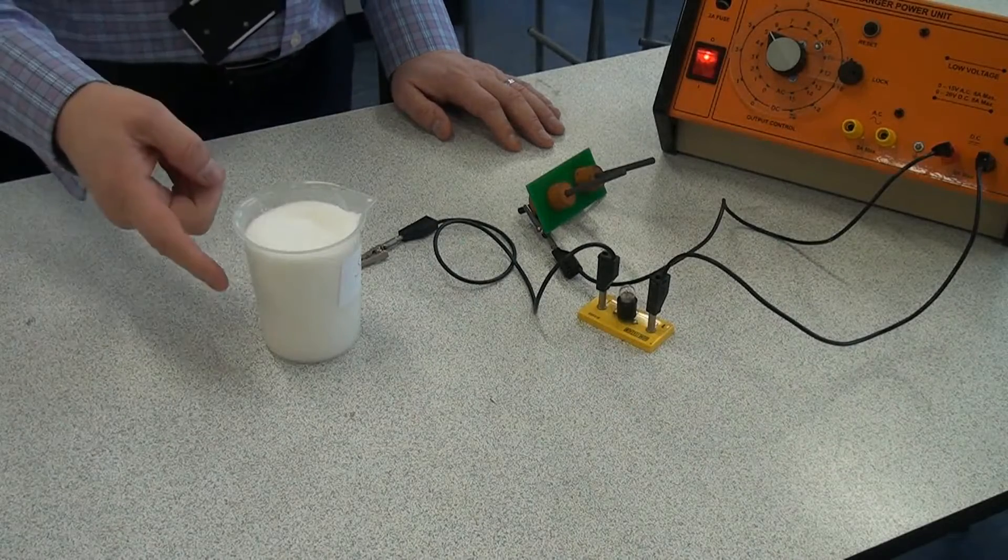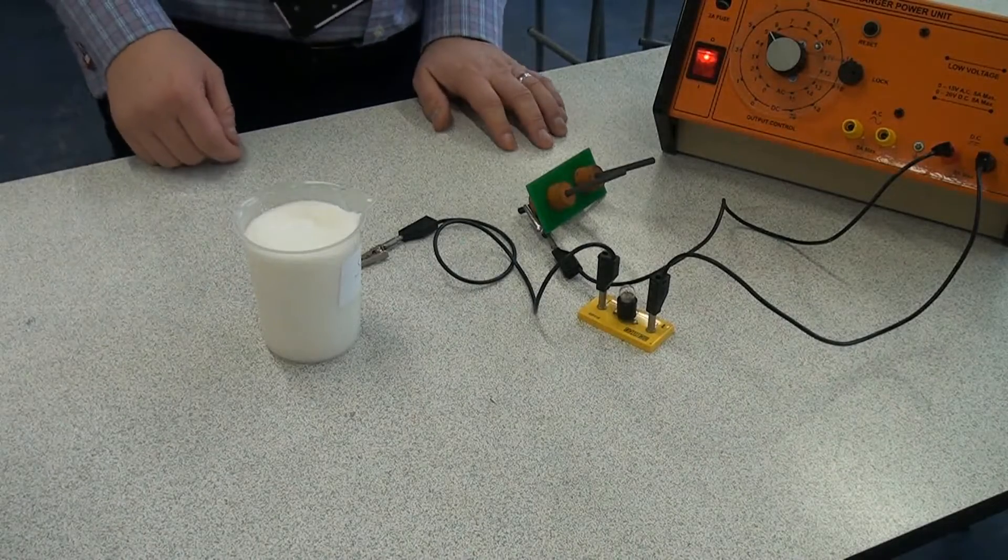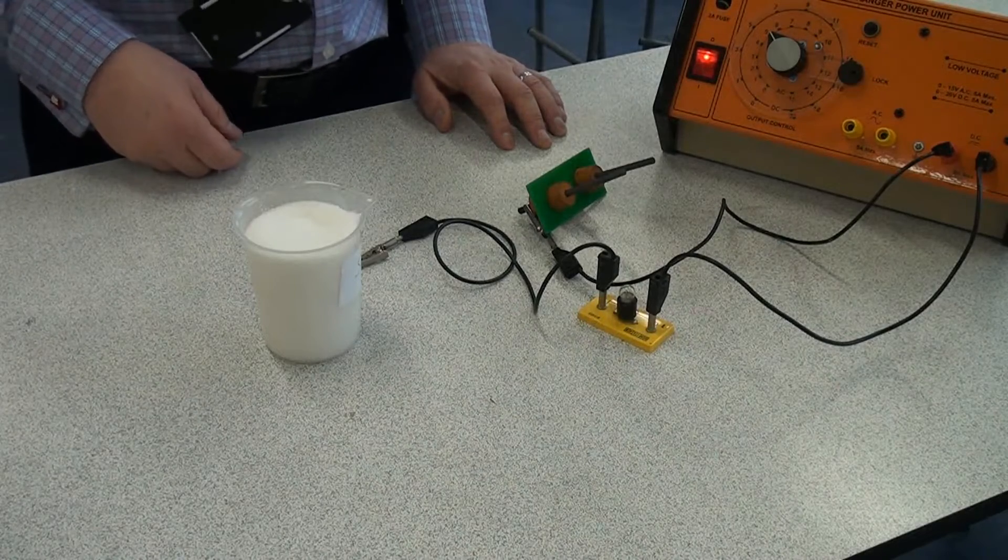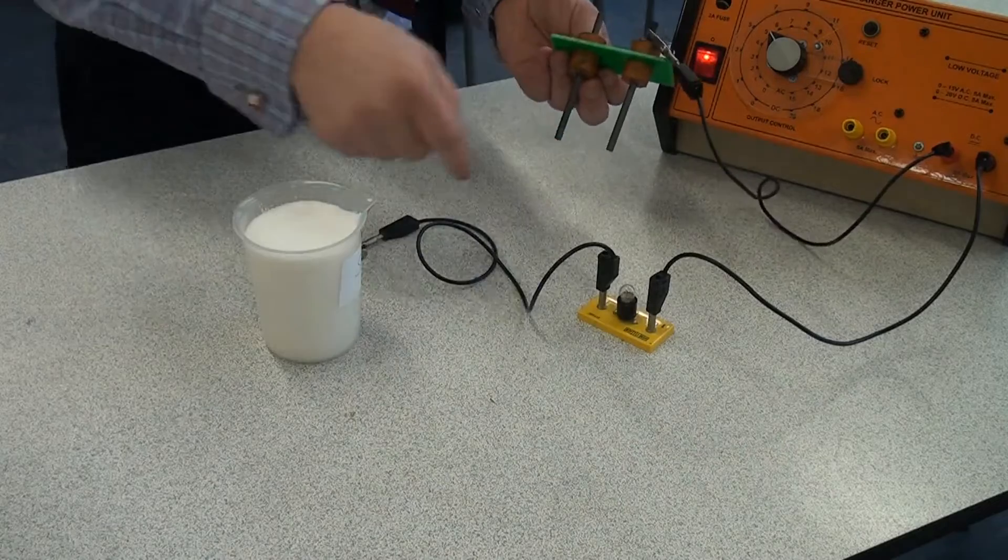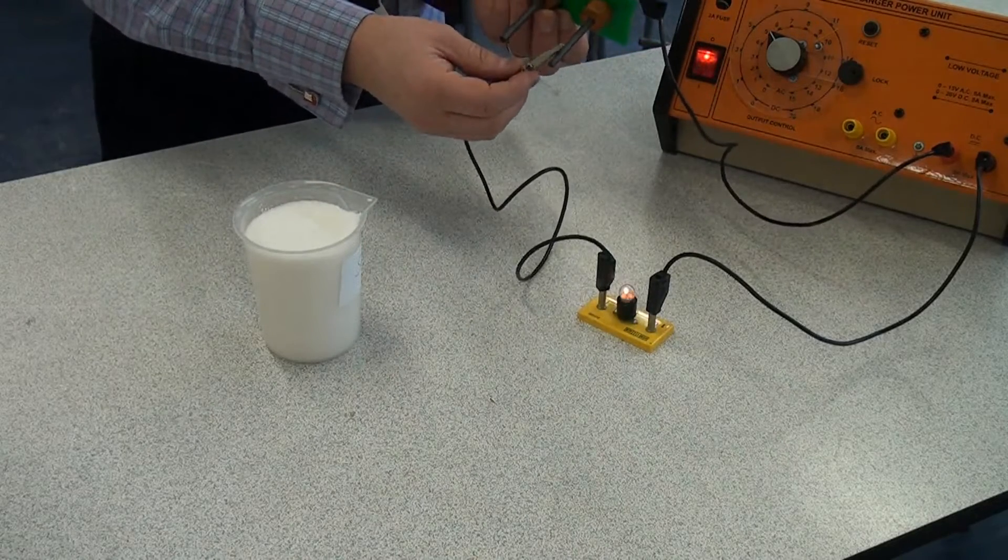So staying with the sugar as my covalent compound I'm going to see if it conducts electricity when it's in solid form. So here I've got a circuit with some electrodes and a bulb and I'll just check that the circuit is working correctly.